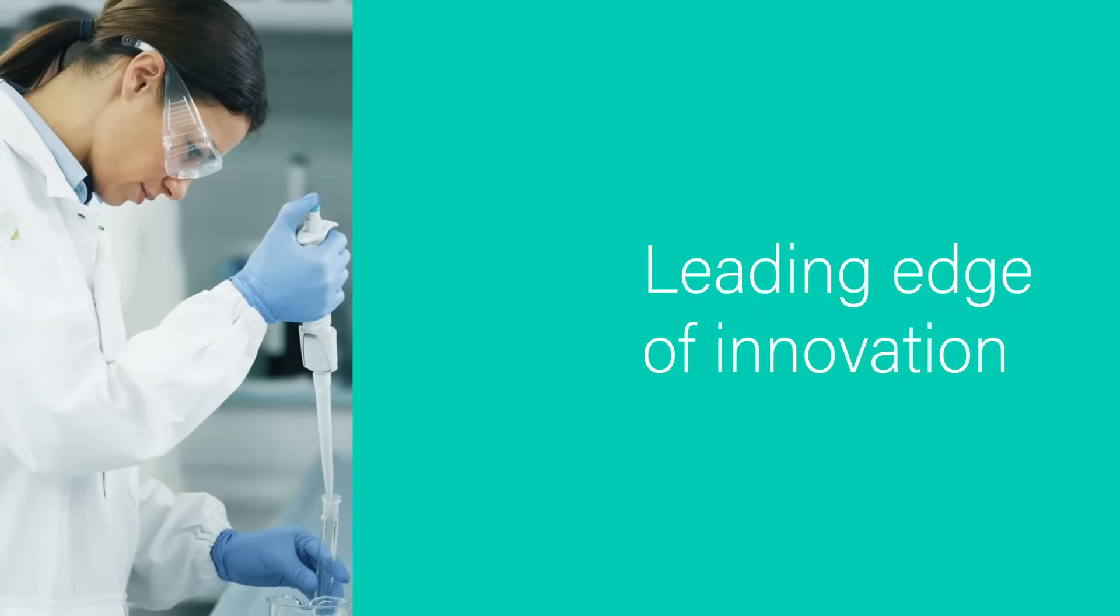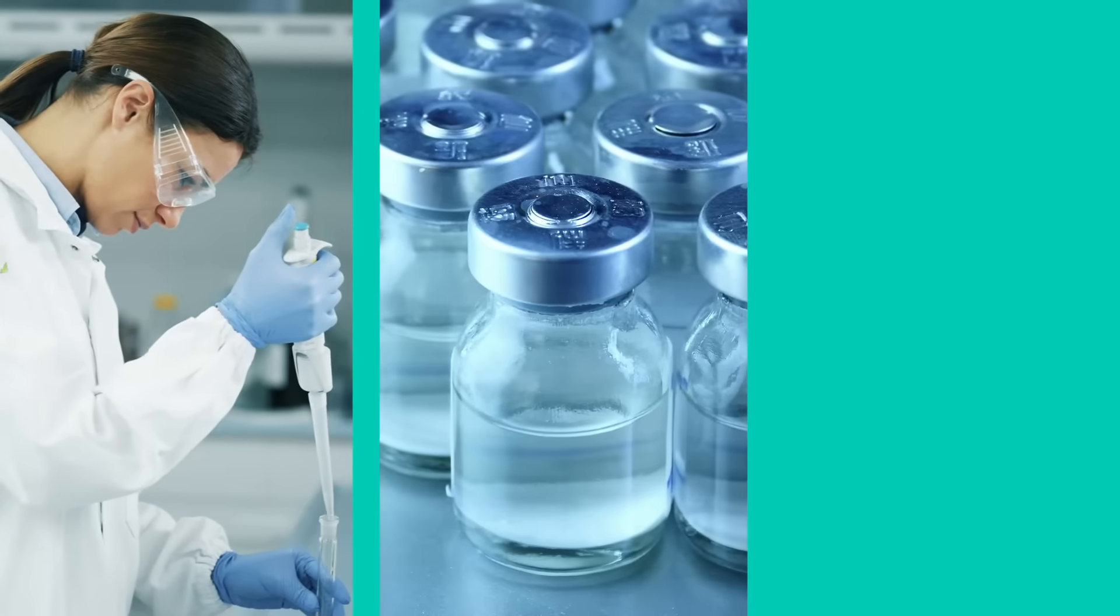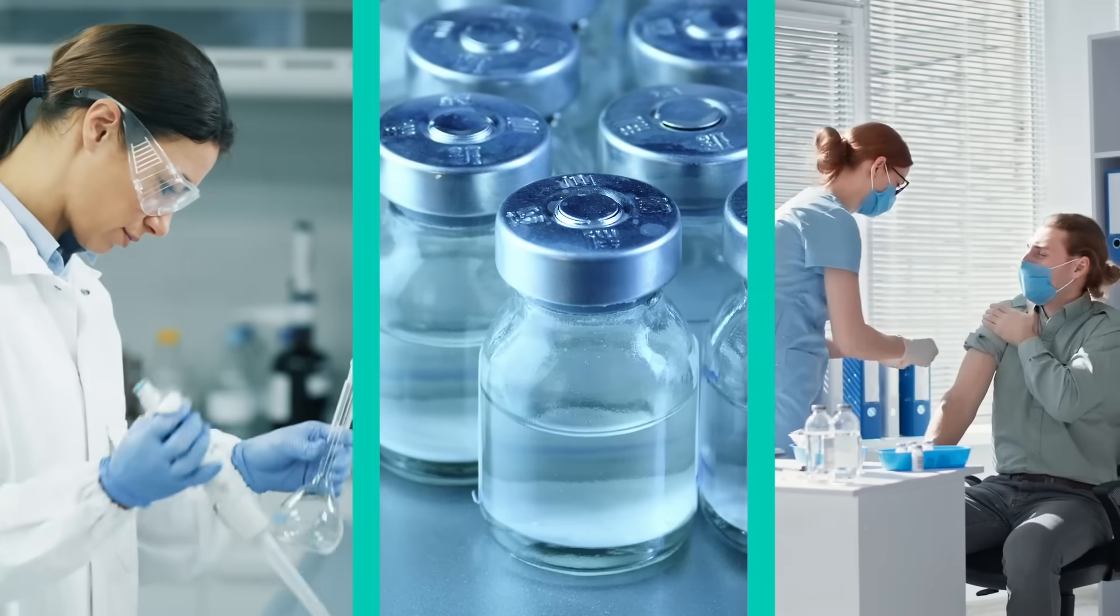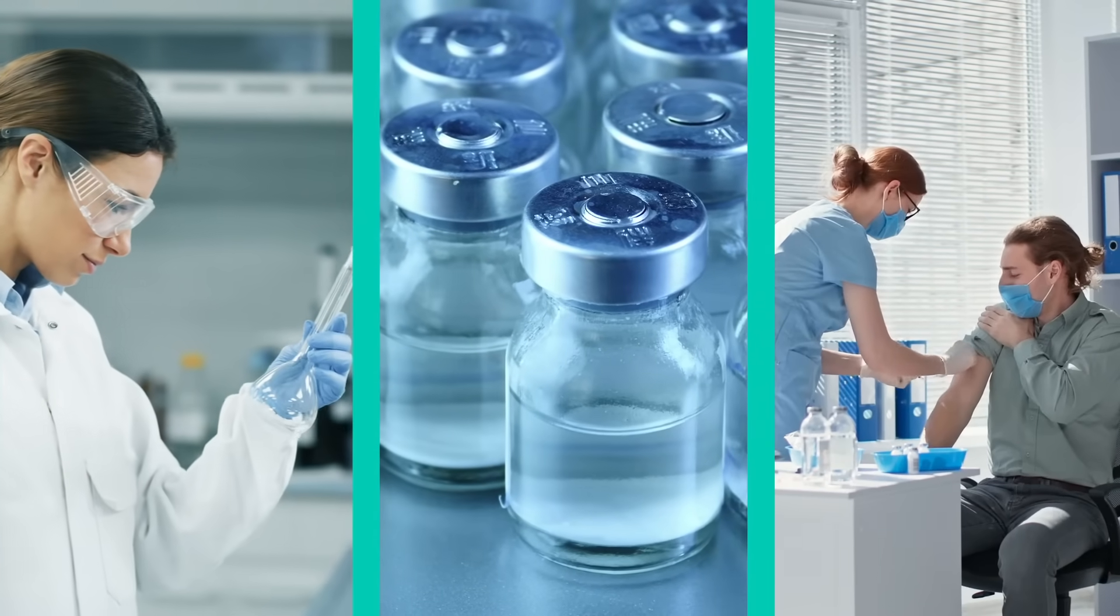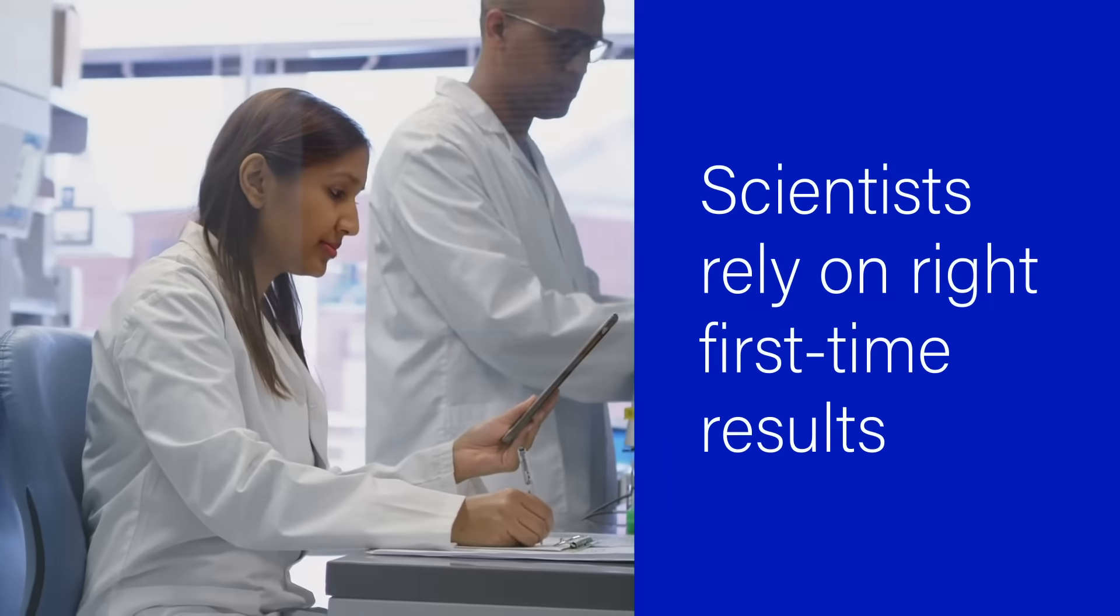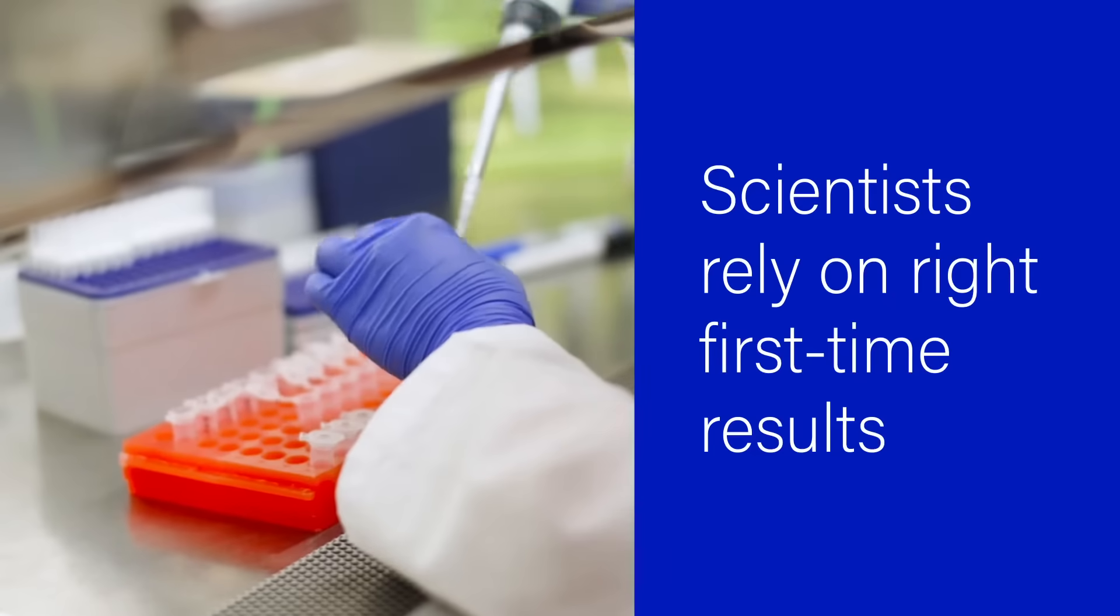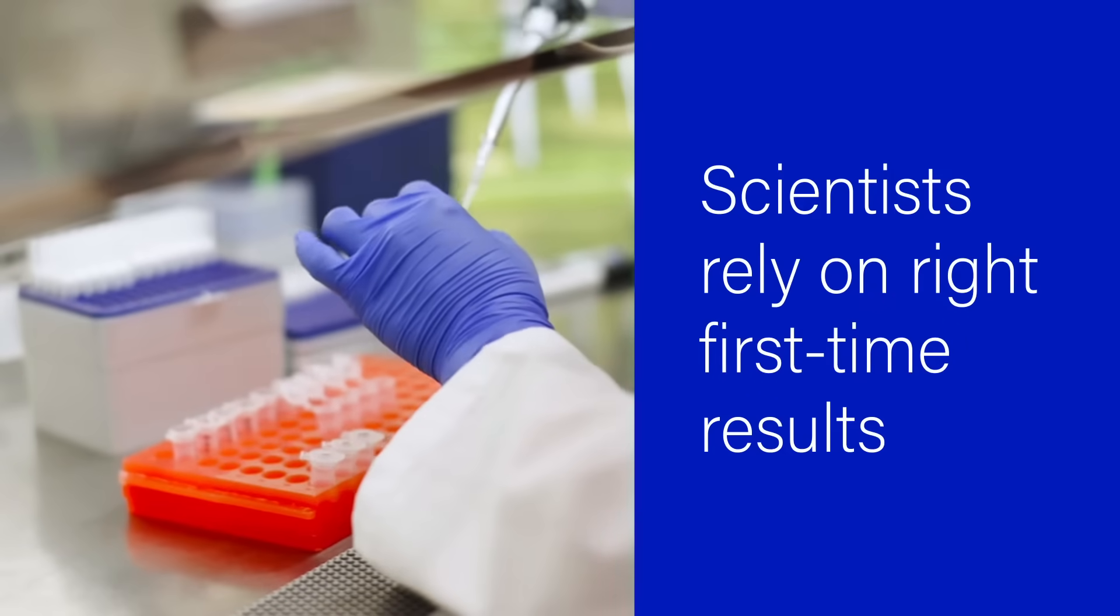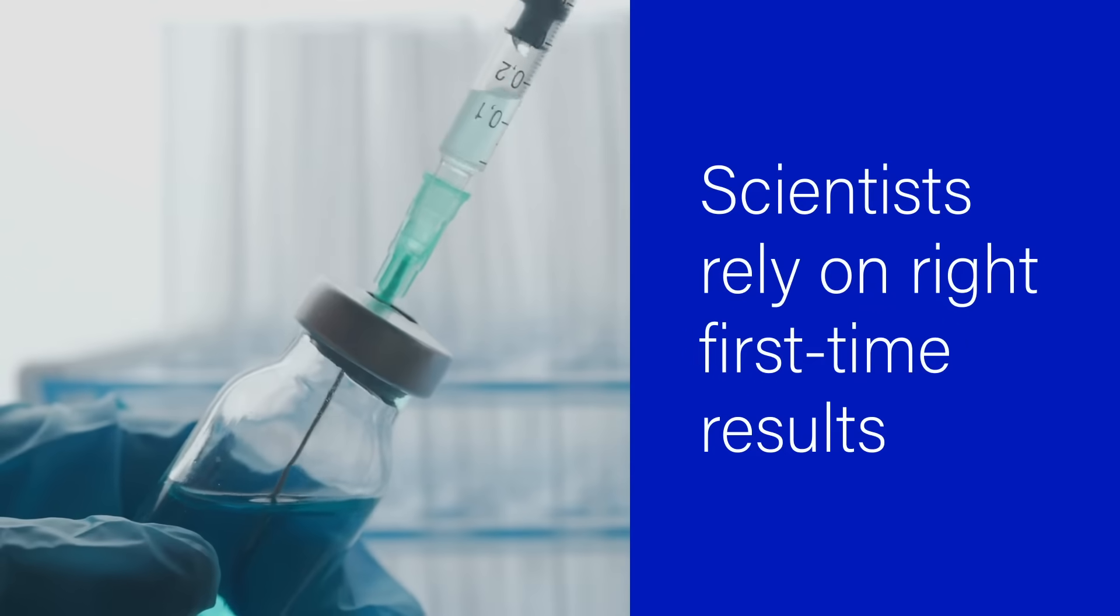Biopharmaceutical companies are on the leading edge of innovation, turning scientific breakthroughs into life-changing treatments. Quality control labs rely on right first-time results to ensure an uninterrupted supply of safe and effective biotherapeutics.